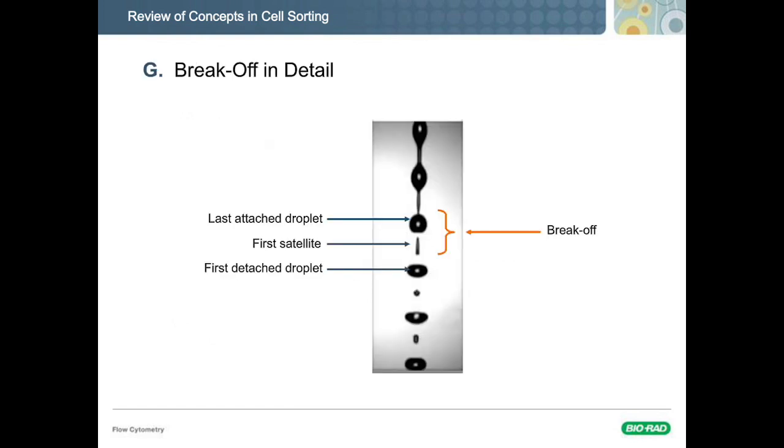Now, as it's breaking off, this is always one of my favorite things to look at. The image that you see here is created by strobing a light in front of the break-off and observing it with a camera from behind. So what you're really looking at is the shadow of a strobed image. And when you see it on the instrument, it always looks like it's just up there displayed, but it's really a live image formed from all of these strobes.